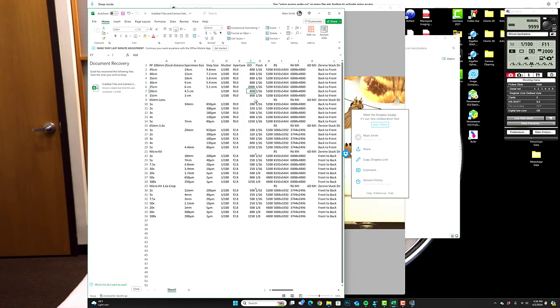So at any point, if the image is too dark or too bright, the only thing that you're going to modify on these settings is either raise the ISO for a brighter image, or you're going to take the flash down to a maximum power of 1/8. I recommend staying at 1/16. If it's too bright, you need to go the other direction. So 1/32 means half that power, 1/64 is half that power. Or if you need to make the image darker, you'll start to make the ISO number slightly lower. So the lower the ISO, the darker the image, and so forth. And the fraction on the flash denotes basically a percentage of power. So if it's 1/1, that's full power. If it's 1/2, that's half power. So hopefully that makes sense for everybody.